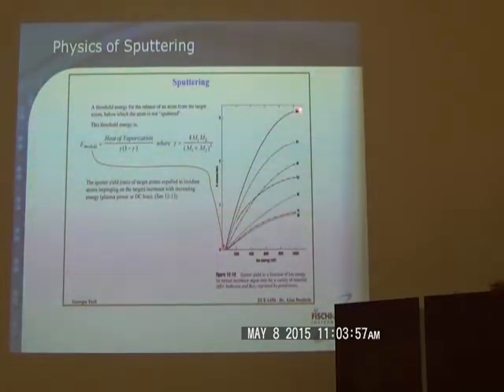For instance, gold and silver are some well-known materials that you usually don't want around in an ion-bombarded environment, because they will leave that surface very quickly and redeposit all around the chamber. Others, for instance, titanium that we use for parts in the 1050 or tungsten that we've used in the past, those tend to not be ejected and end up being found in the wrong places in the environment where the sputtering is going on.